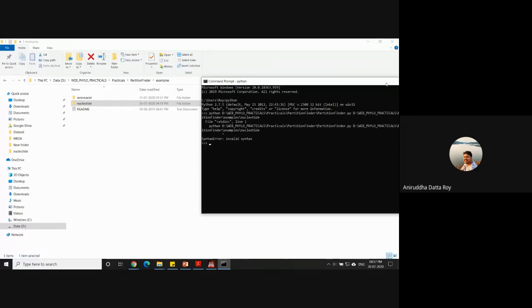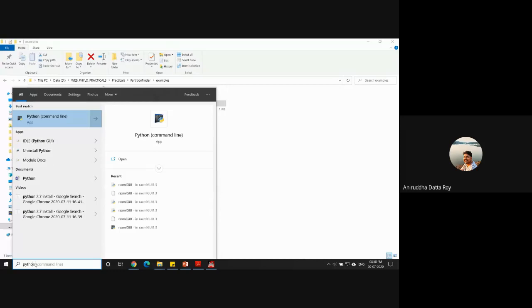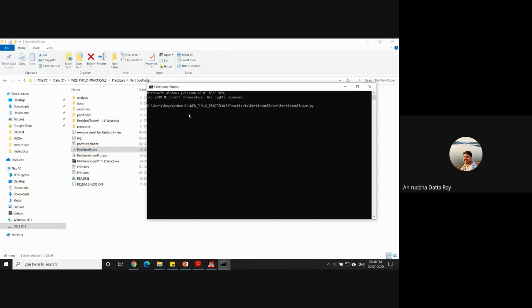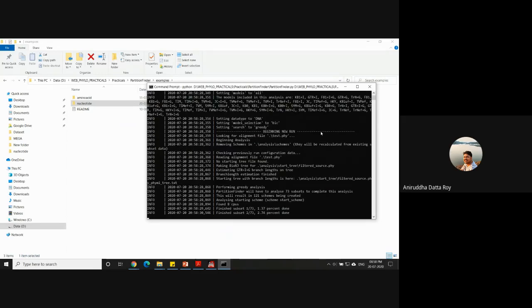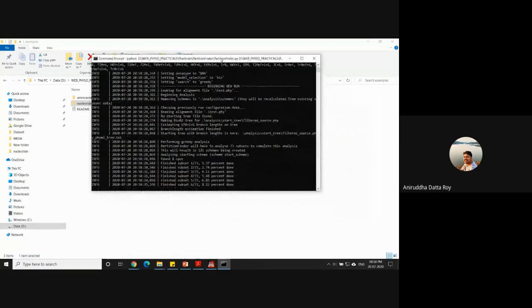Okay, I'm going to try it again. I don't know why the previous one did not work, but I basically did the same thing. And now it has started the analysis.